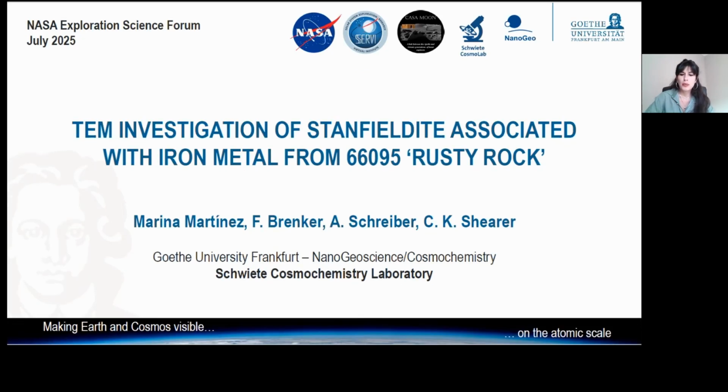I'm going to show some work done by transmission electron microscopy on the most volatile-rich sample brought by the Apollo missions, to learn about the alteration events recorded in this sample, which has been debated for decades.